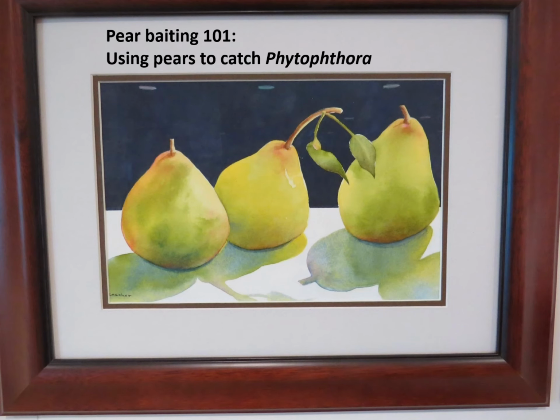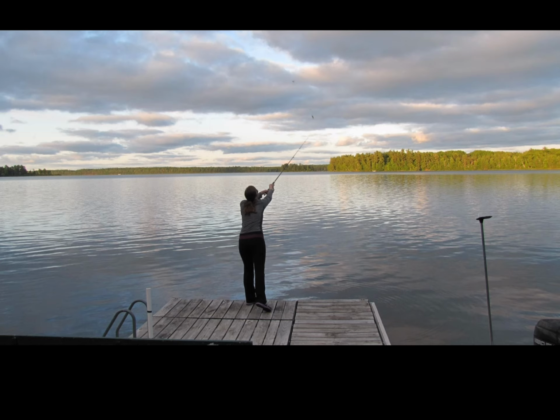One of the methods we can use that is simple and can be applied by nursery people is pear baiting. So we use the term baiting much in the same way as it's used if you're fishing. And the whole point in using a bait or lure in fishing is that you've got perhaps a vast amount of water, and maybe there's some fish in there, maybe there aren't.